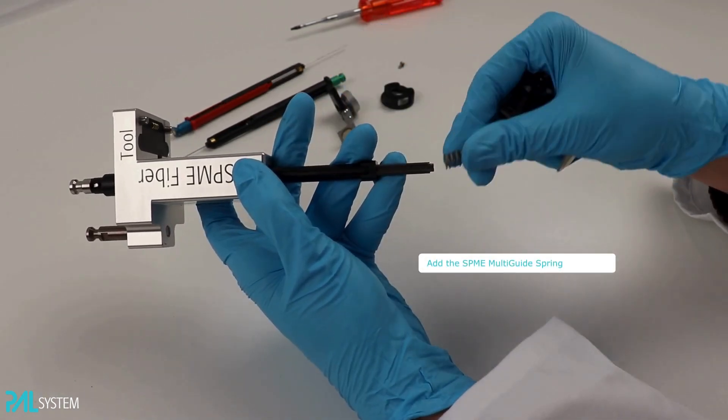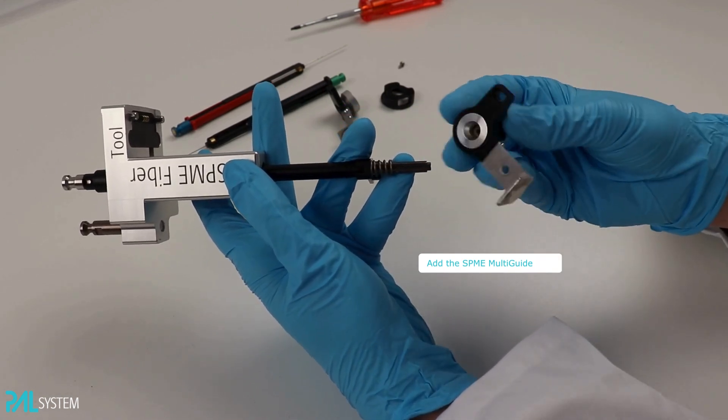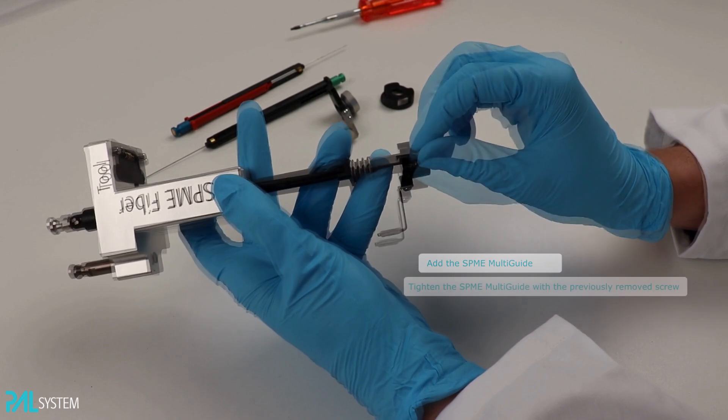Next, place the spring of the SPME Multi-Guide. Ensure that the SPME Multi-Guide is aligned with the form of the hole and the tool. It fits in one direction only. Now use the old screw to keep everything secure.